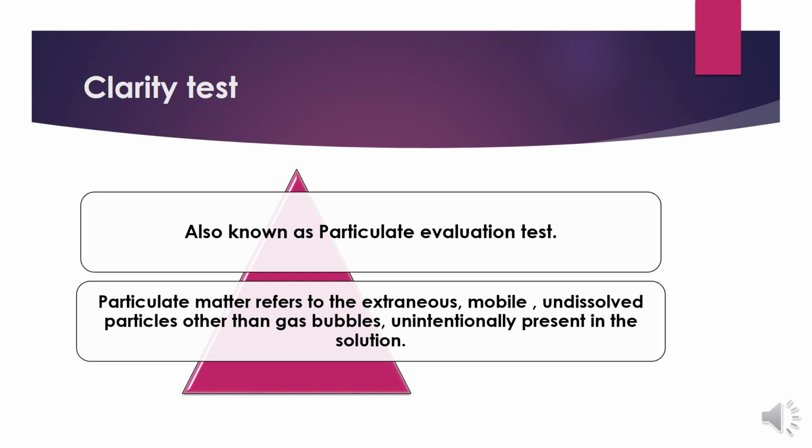Basically, the term particulate matter is applied for any particle or material that is extraneous, that is not part of the preparation, that came from the environment or through different sources and has entered the parenteral preparation.